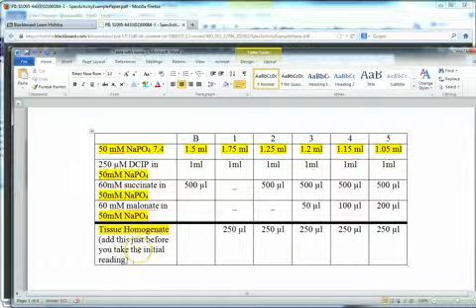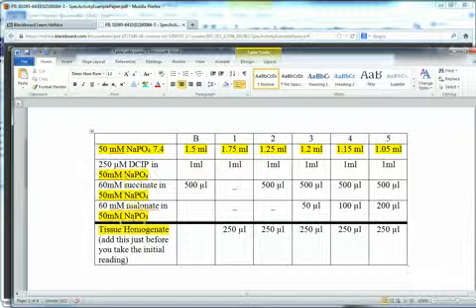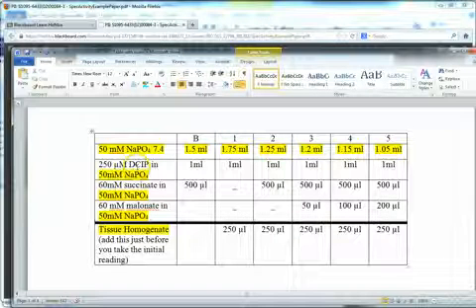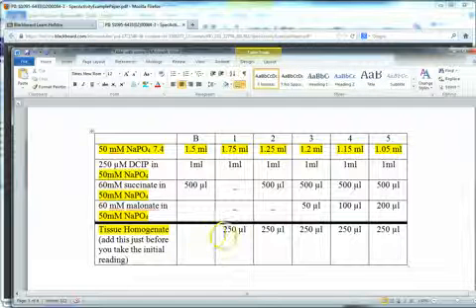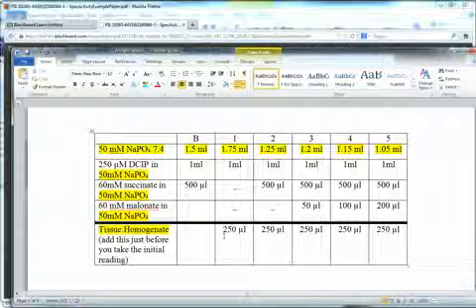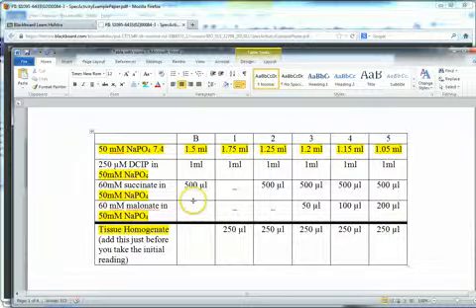The concentration is always the same, even though the volumes are different, because every single reagent was made up in 50 millimolar sodium phosphate buffer. So instead of dissolving my DCIP in water, I was dissolving it in sodium phosphate buffer. Since everything is in sodium phosphate buffer, the final concentration is 50 millimolar. You do not have to do any math to figure out the final concentration of sodium phosphate buffer. It is 50 millimolar. So that's common to all reactions.